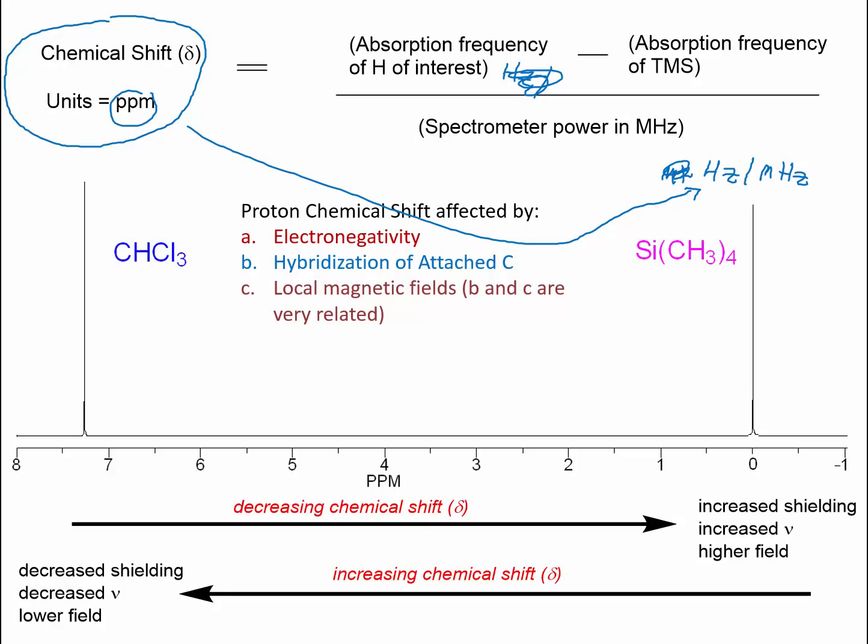All right. Here's a typical NMR spectrum. For a typical proton of an organic system, we're going to see the spectrum go from 0 to 10 parts per million. There's only one type of proton that we're going to talk about in the carboxylic acid chapter that comes outside of this range.